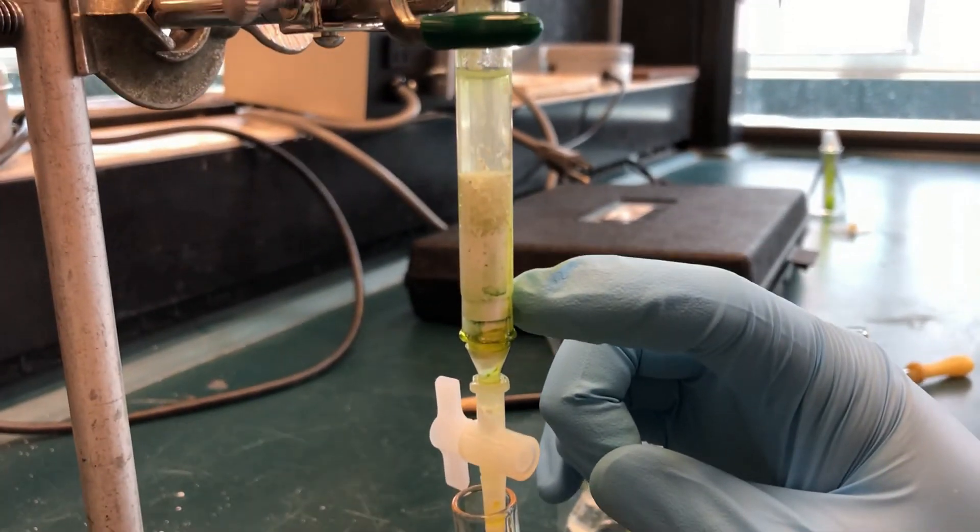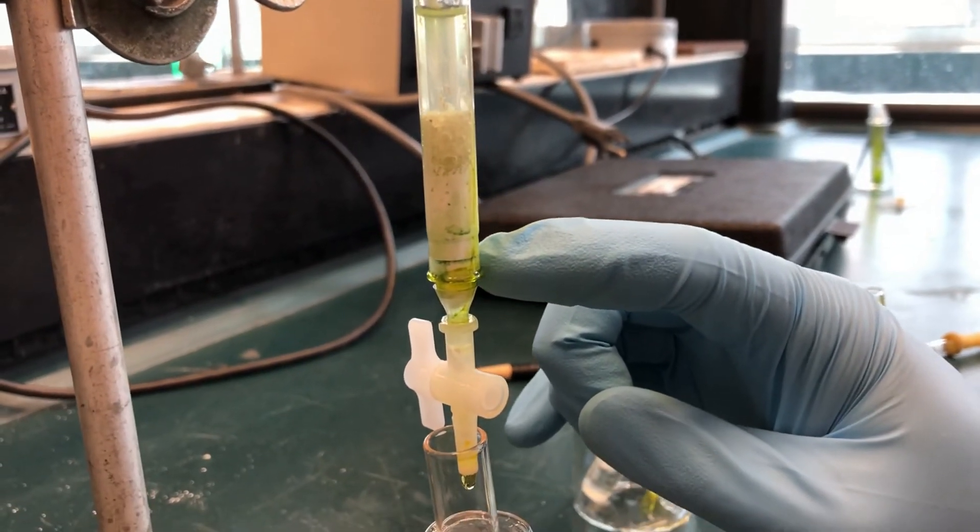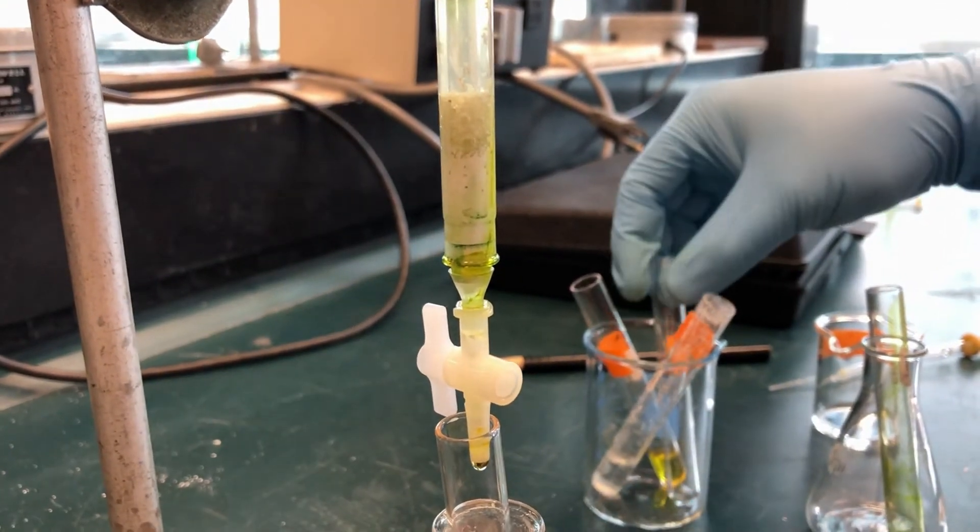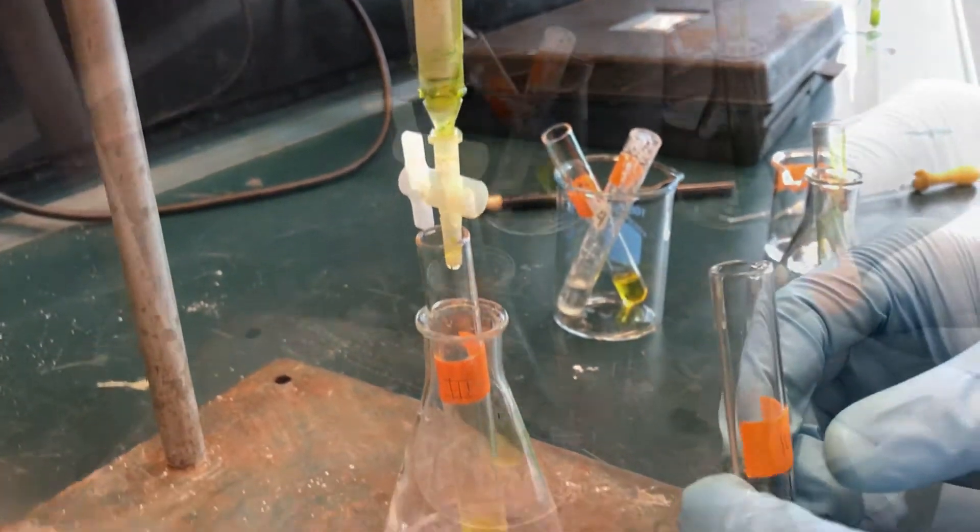Here we can see that the green is moving towards the bottom of the column. We switch collection tubes to collect the green pigment.